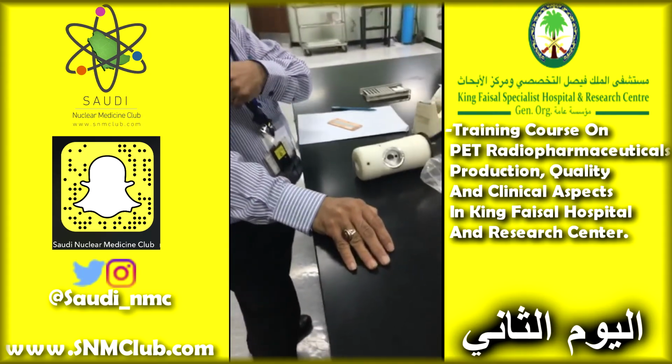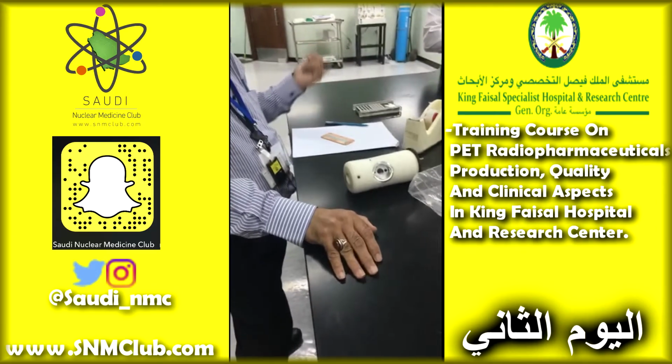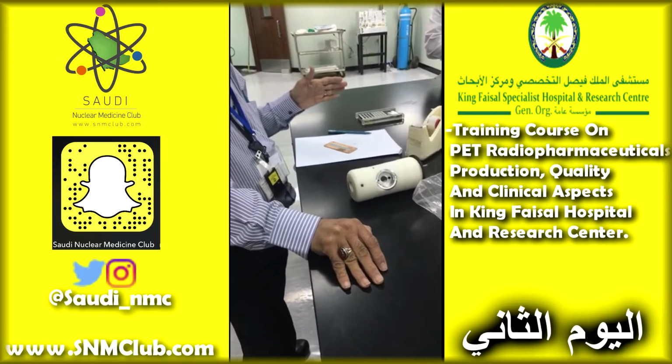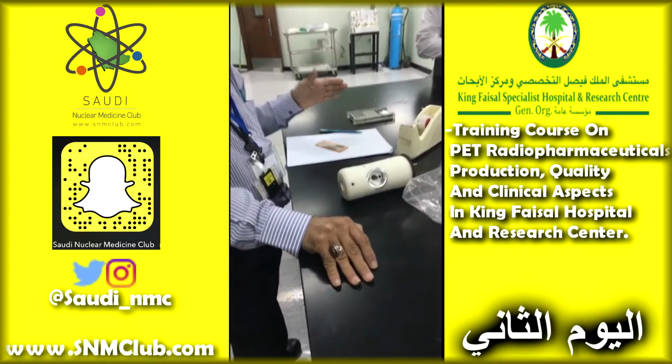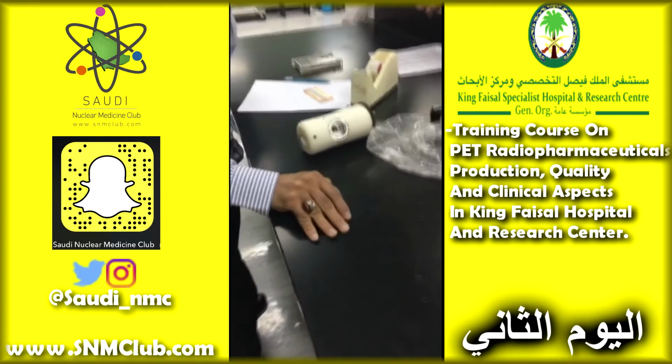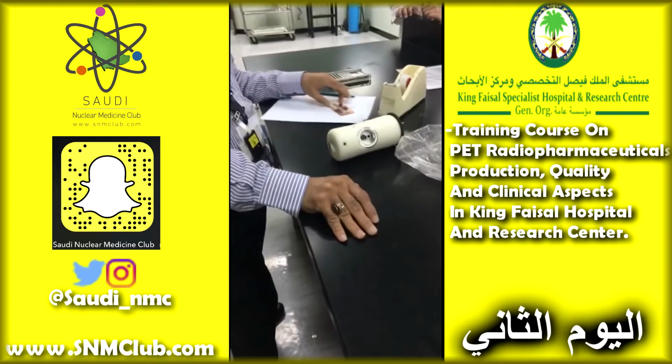Then they're going to take a final sample in which they go to sterility and final tests. And if everything is within specifications, by the time it's released, it will be shipped in packaging.